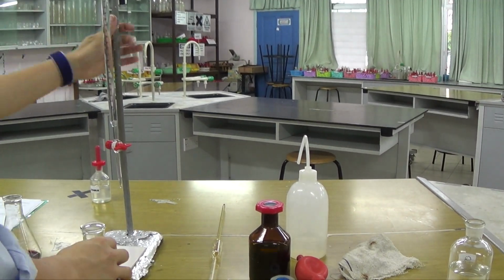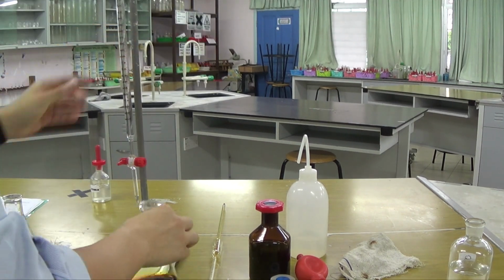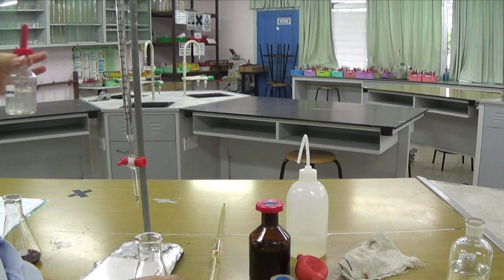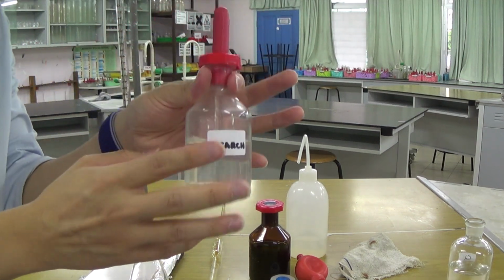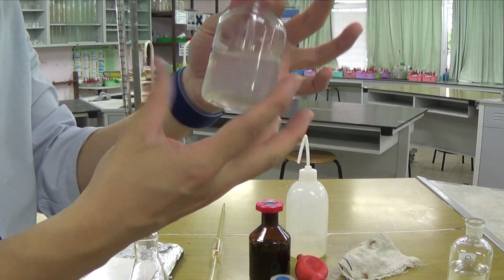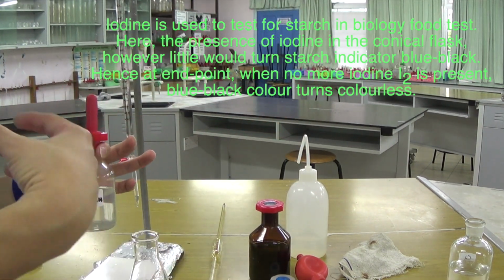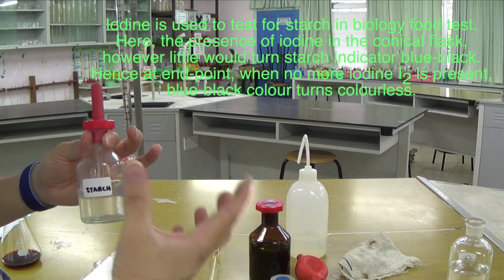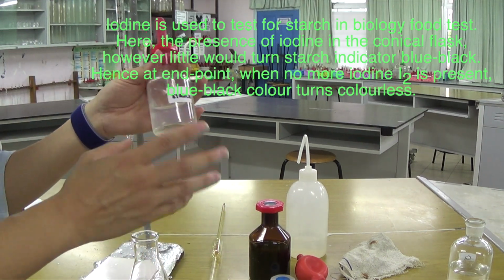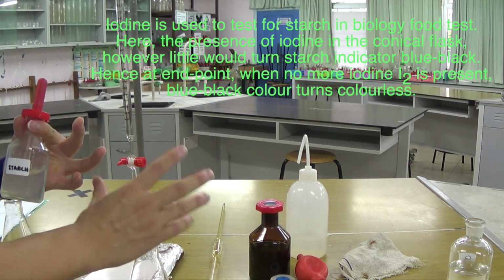Okay, I've got a white tile here so that I could see my color change better. I'm doing a rough titration, and they did say that we want to add a starch indicator. Starch is a cloudy, colorless solution. In the presence of iodine, it will turn the solution blue-black. That's the test for starch in food, in biology. But what we're going to do is add starch to this substance and it turns blue-black because this substance contains iodine.